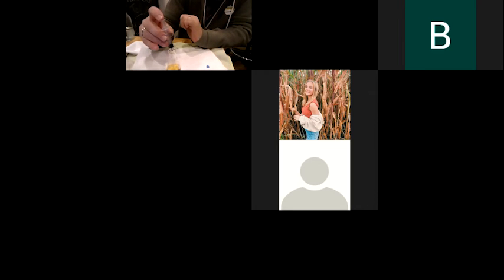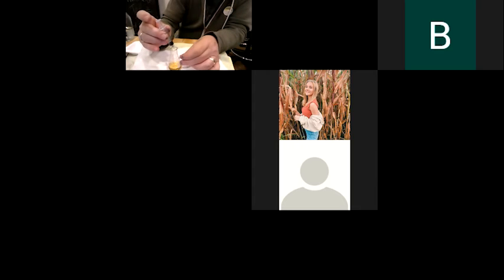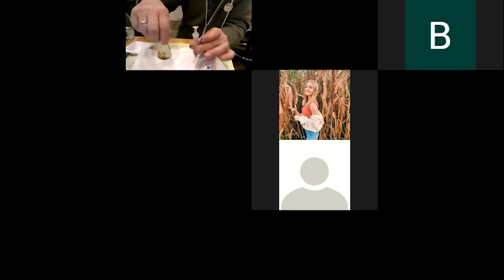Still not quite. Not quite, still yellow. Man, I'm almost done. I almost don't have any left. Oops, I spilled some on the side. Nice. I got some on the side, so that's an error that I will make. I spilled about maybe a tenth of a mil.